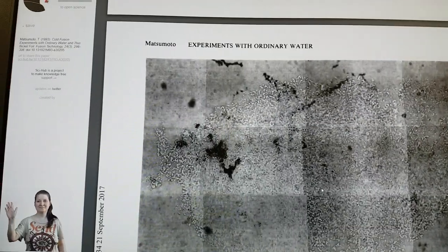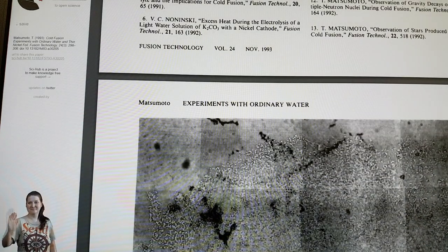I will share this video in the link to the presentation. That's a similar structure to the one Matsumoto saw. The first strange radiation track I saw in Japan — I was just looking at the plate, got back to the accommodation and Dr. George Eagley was standing behind me. I put it under the polarizer and it just popped out. It didn't look like there was anything there and then it just popped out. If I play with the polarizer, almost everything fades away and the evil twin over here is not really visible anymore.